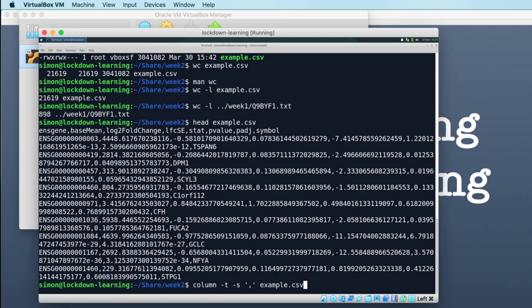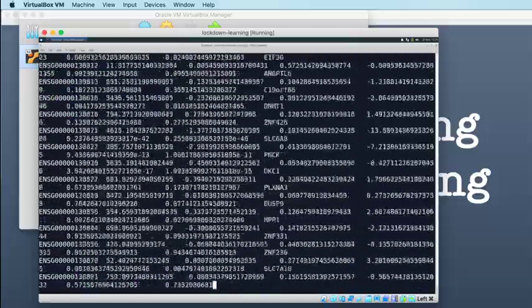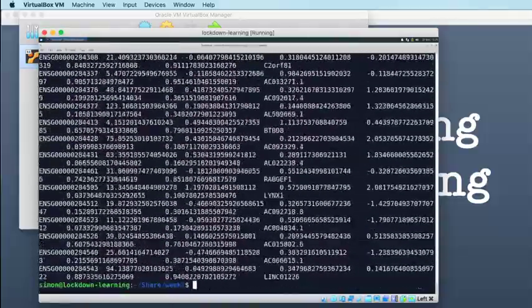Okay, so what this will do is take the contents of our comma separated value file, and it will present it in the terminal as a table with all of the columns nice and neatly lined up. And it will do that by default for the whole table all in one go. So it's working here like cat, and it's splurging our table out to the screen.